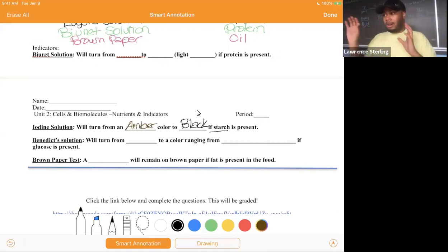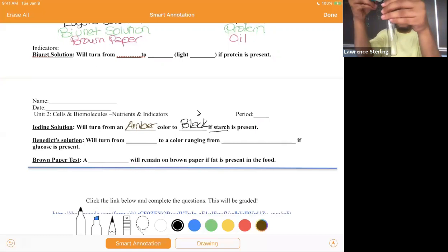All right, our glucose is looking pretty good. Let's move on to the other test. Now, next is protein. And remember, we had to mix two different solutions for two different compounds. So we're just gonna put a few drops of copper sulfate.